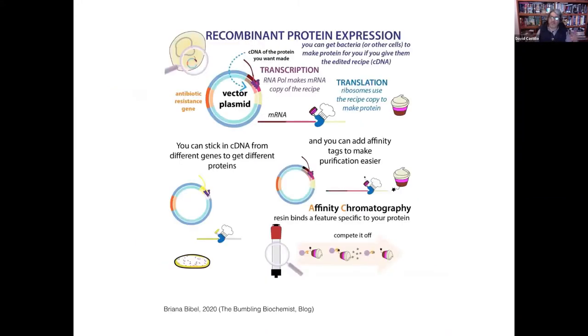But anyway, the general idea is, I guess this is going in another direction, like Adrian suggested. Not all proteins are made equal, and not all proteins require the same thing. For example, when you're purifying from mammalian cells or from algae or bacteria, all of them will definitely require different types of treatment. One of the most important parts is at the level of transcription, and post-translational modification. It's a critical step for many proteins, essentially those from eukaryotes, that are required to become decorated with several types of molecules, like glycosylations or any other type.